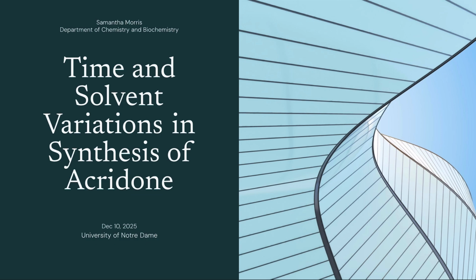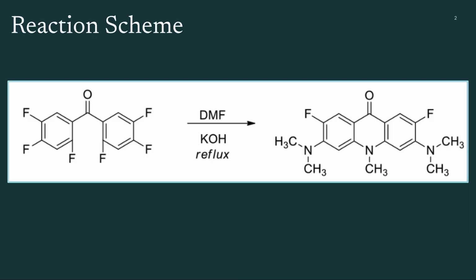This project focused on how adjusting reaction time and solvents used for recovery affect the yield, purity, and recovery of acridone synthesized from a nucleophilic aromatic substitution reaction, which you can see right here in this reaction scheme. This is the synthesis that I was working with.